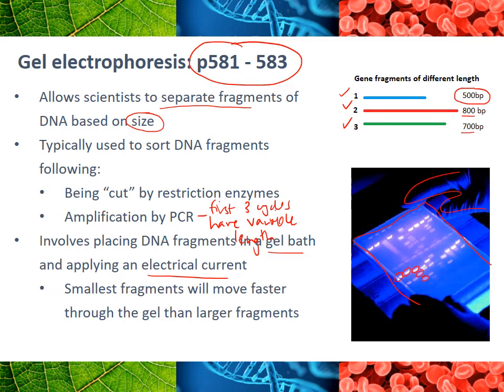We'll come back to this in a second, but it's important to know that the smaller fragments of DNA move faster through this gel than the larger fragments. Again, we'll come back.